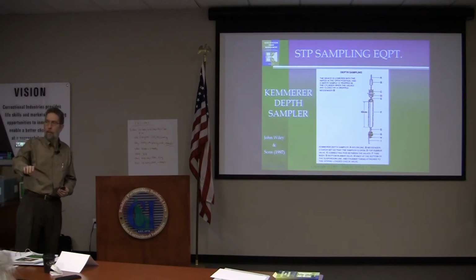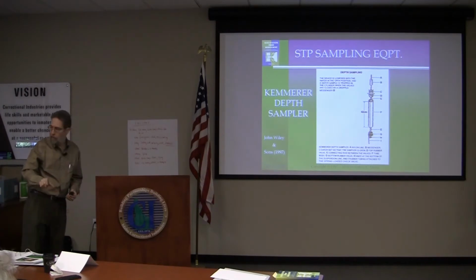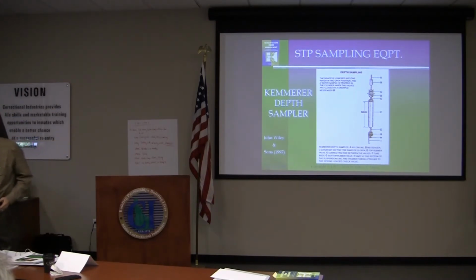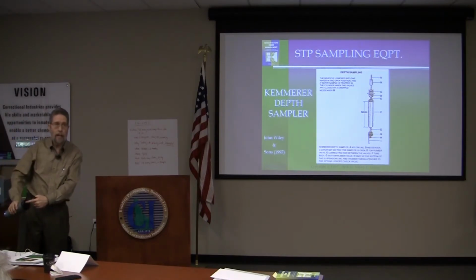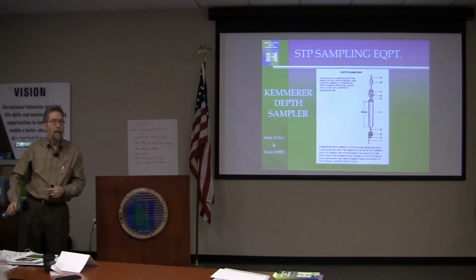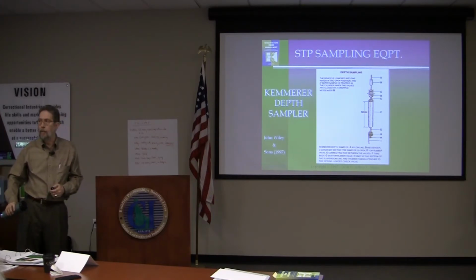And so you submerge it, and typically you tilt it. I'll borrow this a second. This is roughly the size of the sampler. You put it in, it's got a hole at the bottom, it's got a hole at the top. The water or whatever liquid goes in the bottom, and the air comes out the top. Now it takes about 2 minutes to fill this.